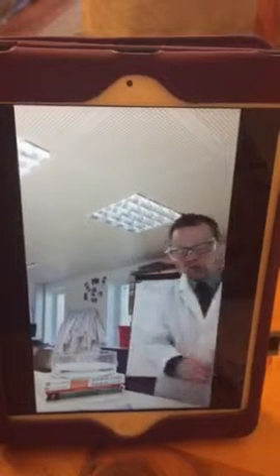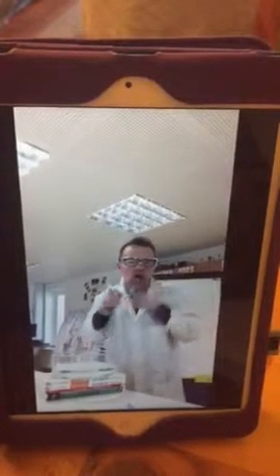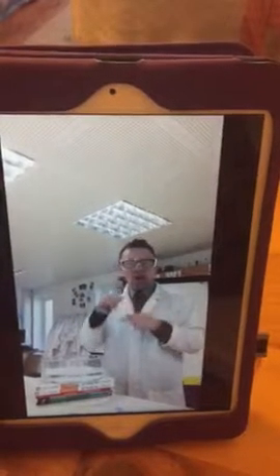This one seems a little dark in colour. I think this is probably due to the fact it's been in and out of the container and reacting with the air, so it looks a bit darker. But when we cut into it, it's still quite shiny.